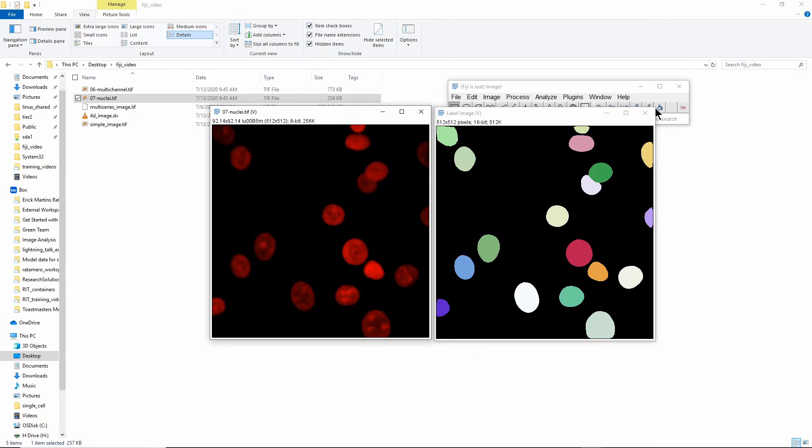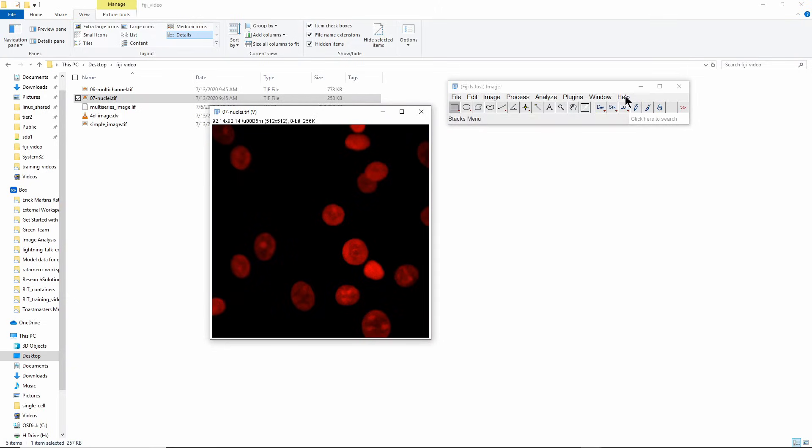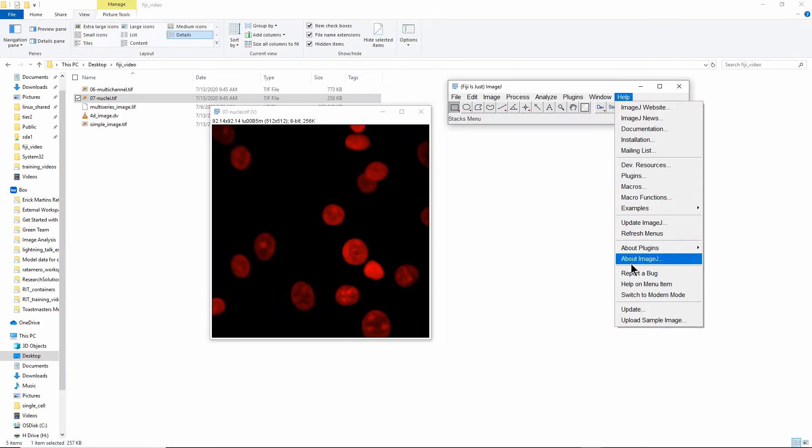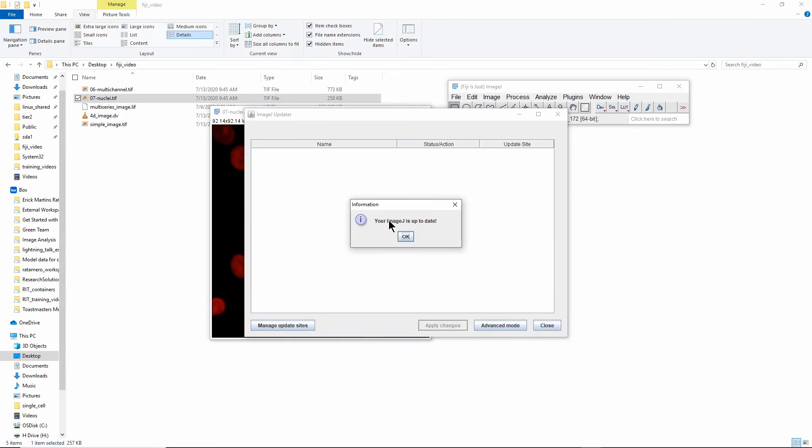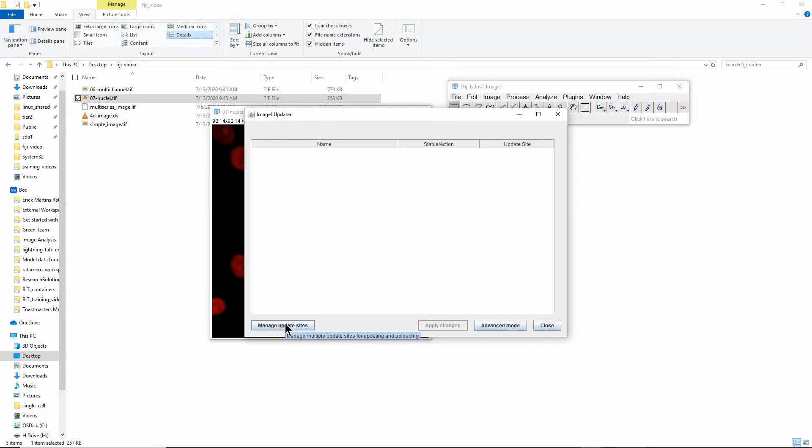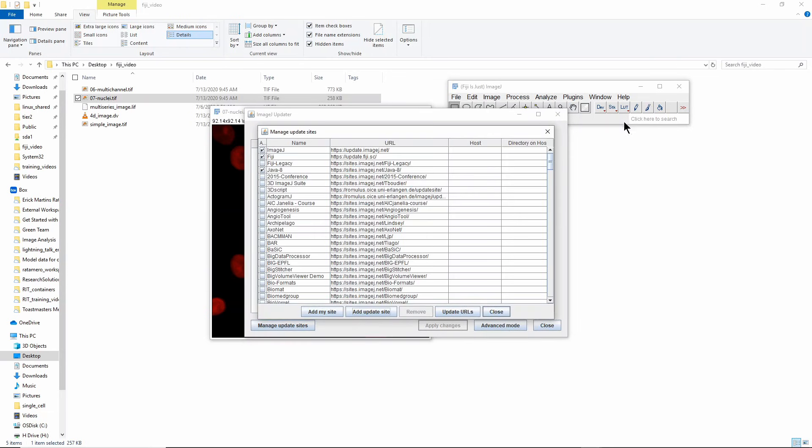The way you would install StarDist is you will go to Help > Update, and this is actually also the way you update things in Fiji of course. It's going to download the information about new packages and sometimes that takes a little while. It tells me my ImageJ is up to date because I just downloaded it, it's completely fresh.